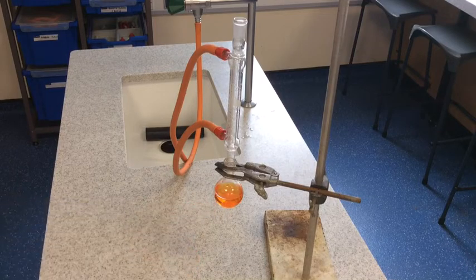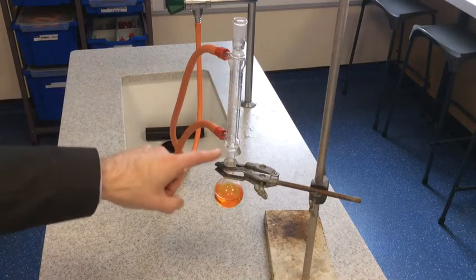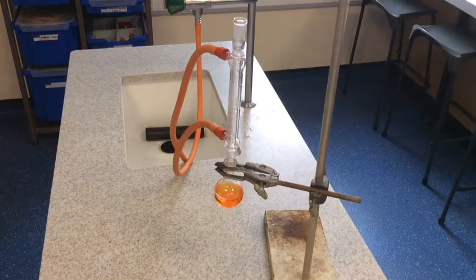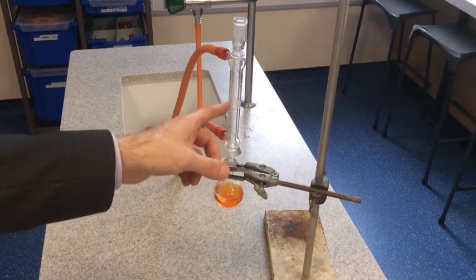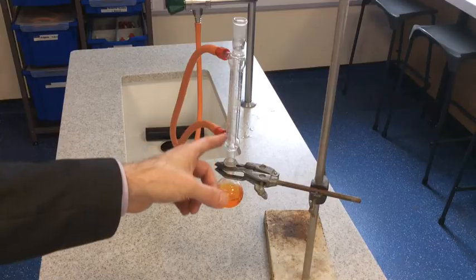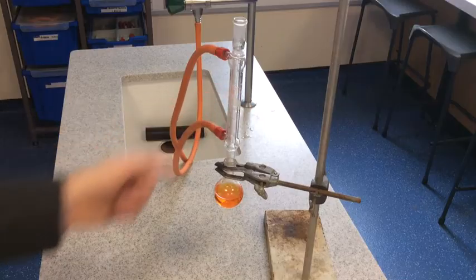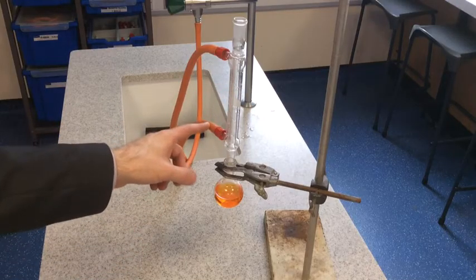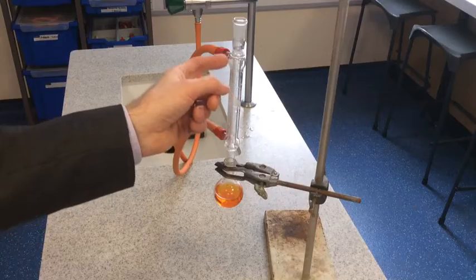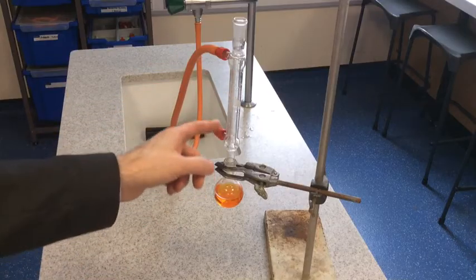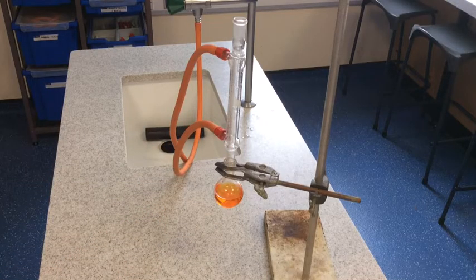This piece of apparatus here is what we call a condenser. Essentially it's two glass tubes in one. We've got a central glass tube running right through the middle of the apparatus, and wrapped around that is a second glass tube which is going to allow a flow of cold water. It's going to come in at the bottom here and flow up and out at the top. This will surround the inner glass tube and you'll see the purpose of that once we get the experiment underway.